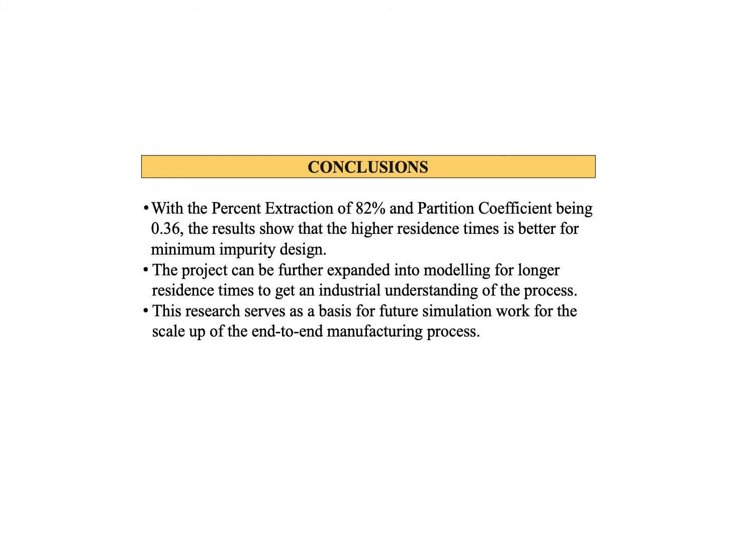The project can be further expanded into modeling for longer residence times, as well as future simulation work of the end-to-end manufacturing process scale-up. It also gives us an insight about the continuous manufacturing process, which is where the pharmaceutical industry is headed now.